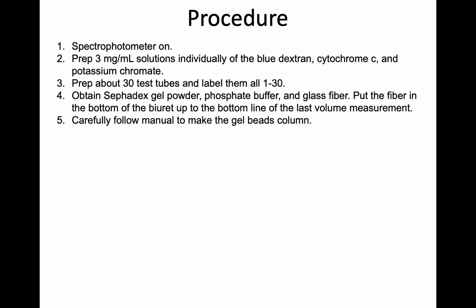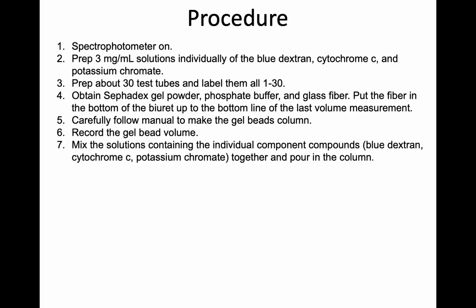Now, the details of how to carefully assemble the gel column are all present in the lab manual, so please follow those carefully, because an improperly assembled gel column is going to lead to a wrong experimental procedure. Of course, record the gel bead volume.